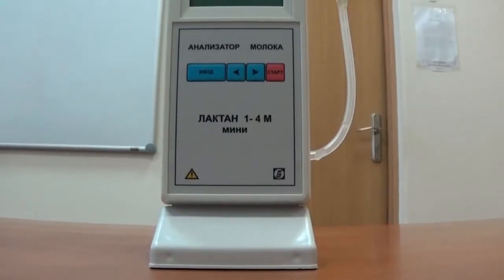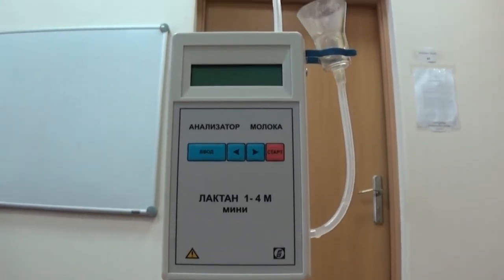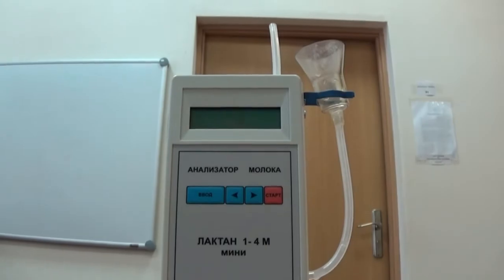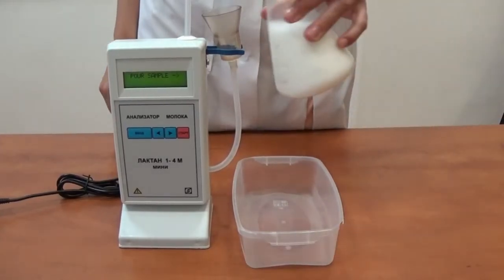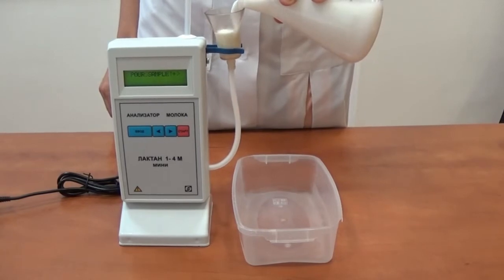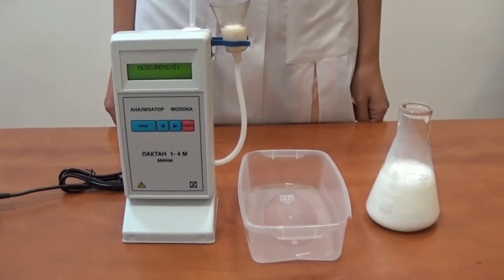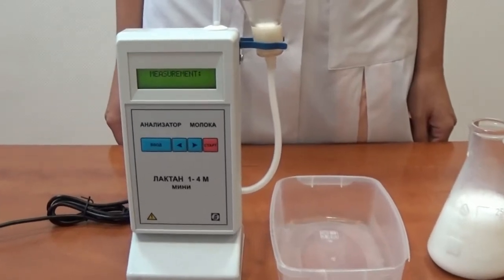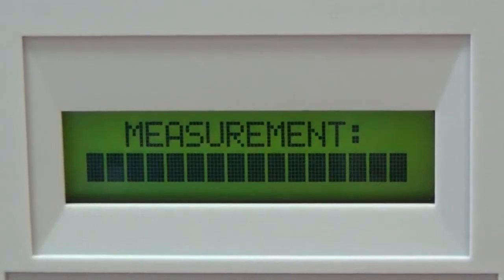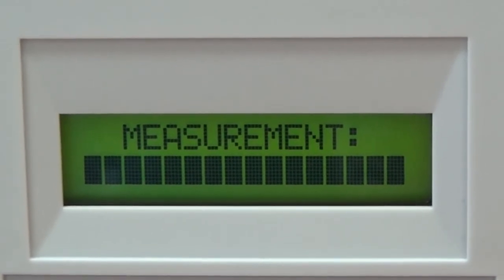In this video we would like to demonstrate the operation of the new version of our milk analyzer, Lactan Mini, with the option of measuring protein. Lactan Mini is a portable, compact, fast operating and easy to use milk analyzer intended for the analysis of the five most important measuring parameters.